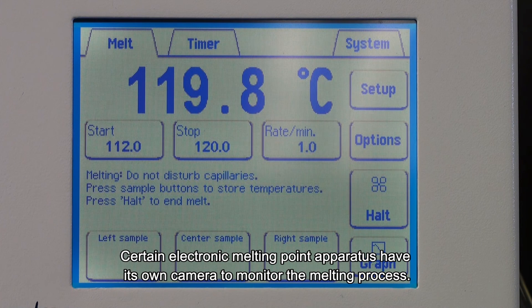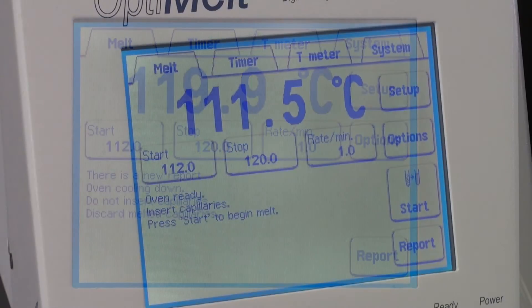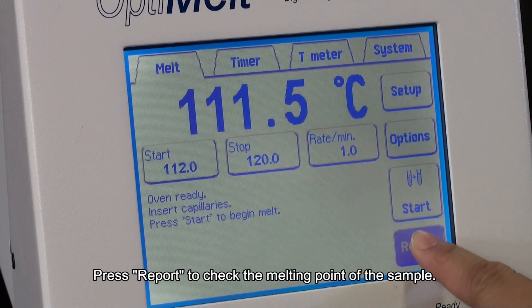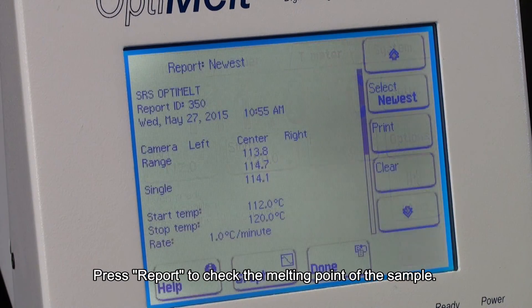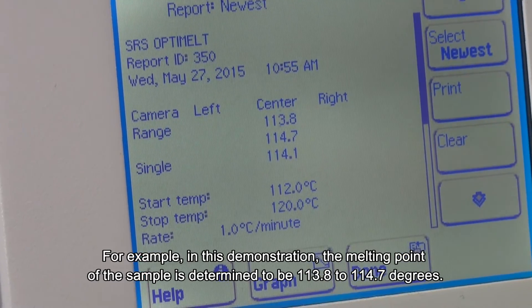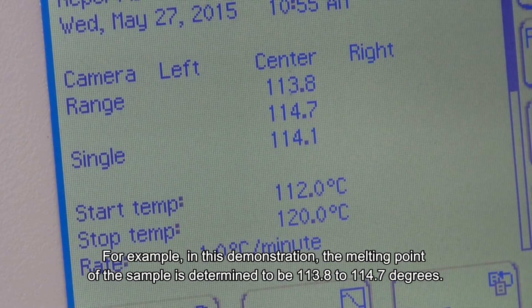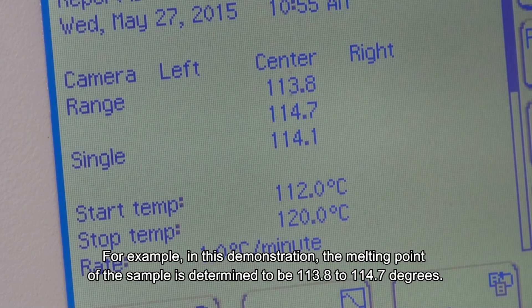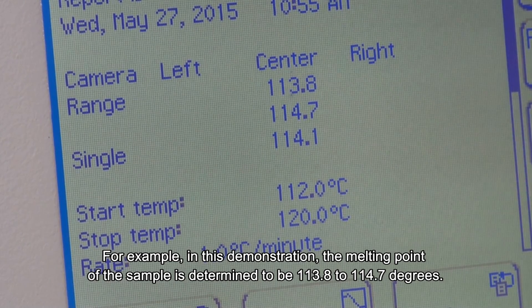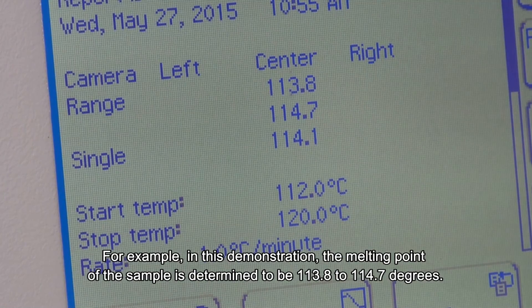Certain electronic melting point apparatus have their own camera to monitor the melting process. Press Report to check the melting point of the sample. In this demonstration, the melting point of the sample is determined to be 113.8 to 114.7 degrees Celsius.